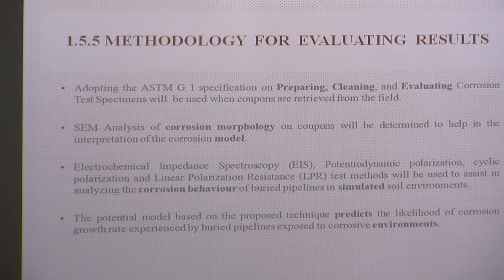The methodology for evaluating results: we'll adopt the ASTM G1 specification, which shows exactly how to prepare, how to clean, and how to analyze the samples when taken from the soil to get the corrosion rate. The SEM analysis of the corrosion morphology of coupons will be done to help in the interpretation of the corrosion model. And the electrochemical impedance spectroscopy, potentiodynamic polarization, cyclic polarization, and linear polarization methods will be used to assist in developing the model.